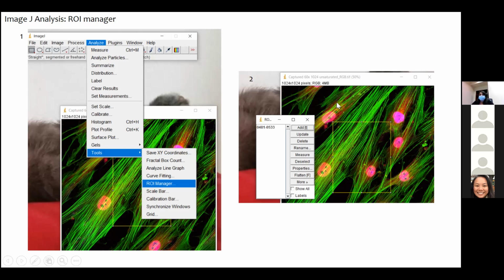Versus if I did a cytochalasin D staining, for example, and that breaks down the F-actin, I could make that square here, sorry, I'm trying to get the pointer. I could make it here and report that as the staining. So if I report the staining here as an intensity of say 20 and here it will become 10, then it's like, okay, I could get away with it.